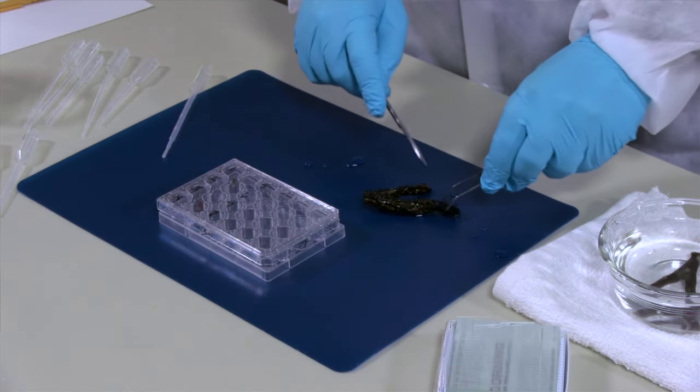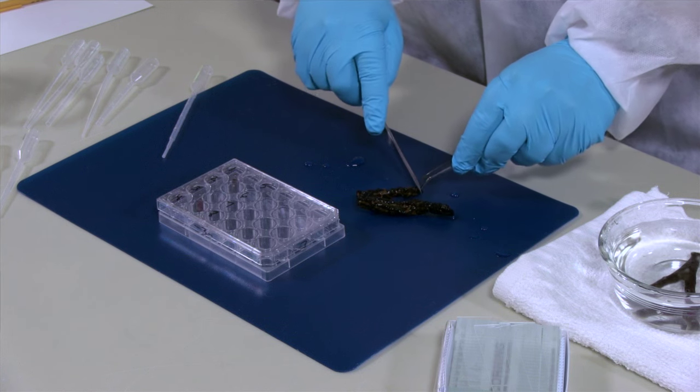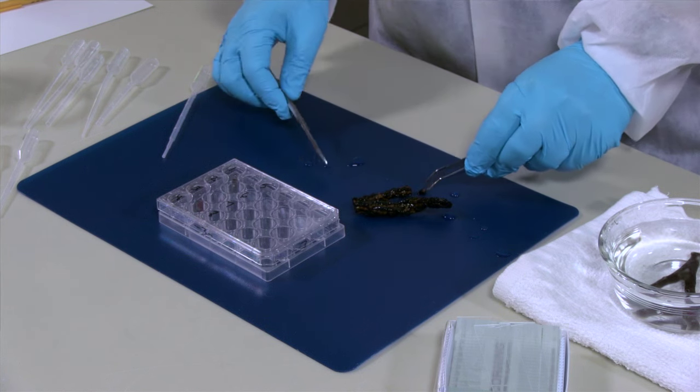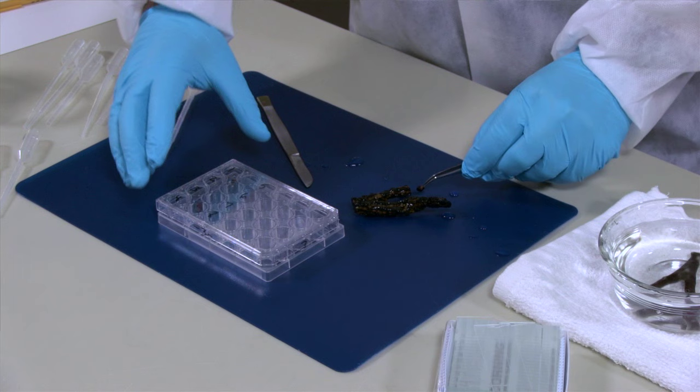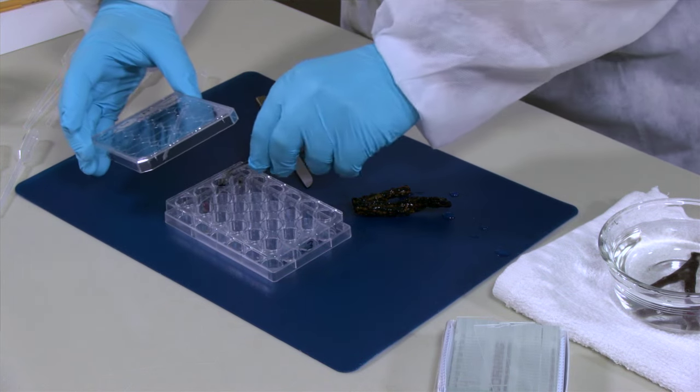We'll take this sponge, cut a small chunk off the sponge, and place it in the well.